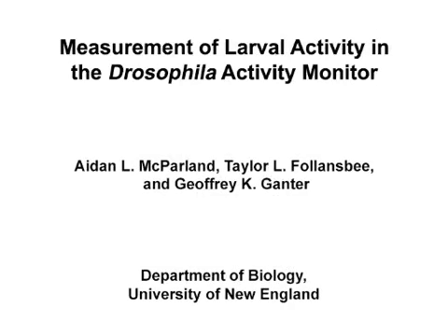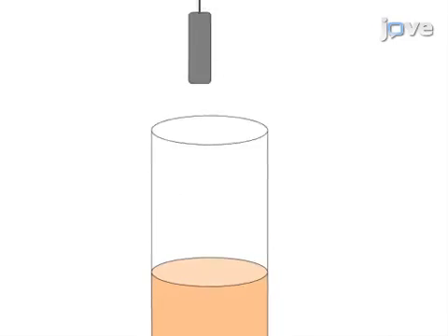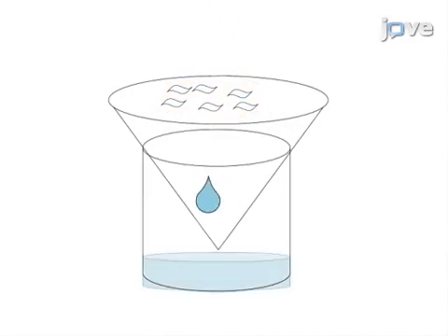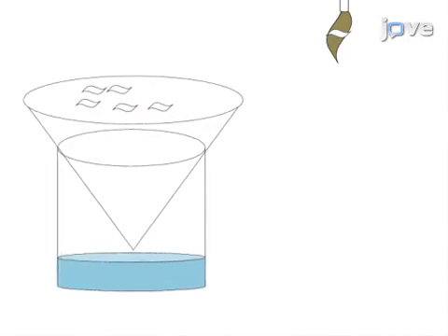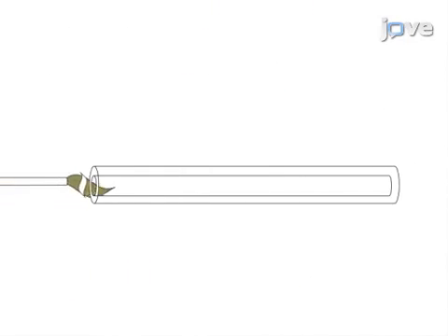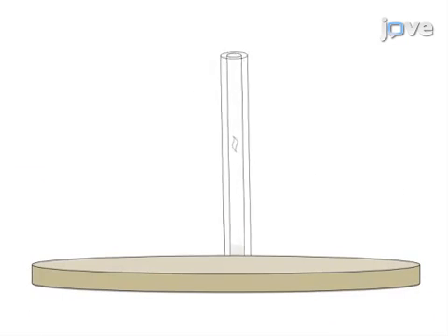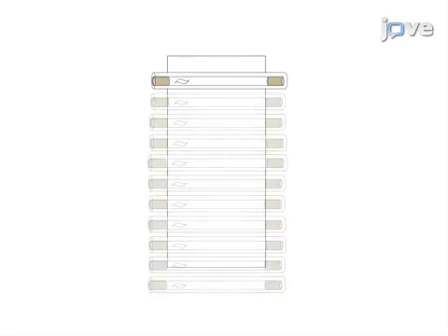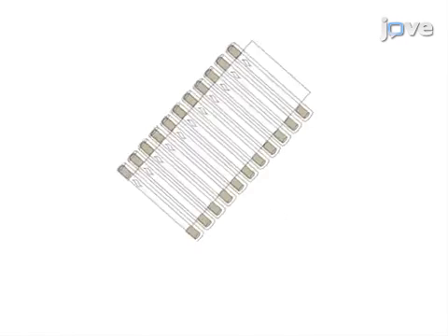The overall goal of this procedure is to analyze larval activity without the use of complicated video analysis software. This is accomplished by first transferring selected larvae to a mesh filter to clean away debris. Next, individual larvae are transferred to assay tubes where they are secured by agar plugs, which are inserted into a Drosophila Activity Monitor, or DAM device. After three to five minutes of acclimation, recordings are taken from the DAM system for analysis.